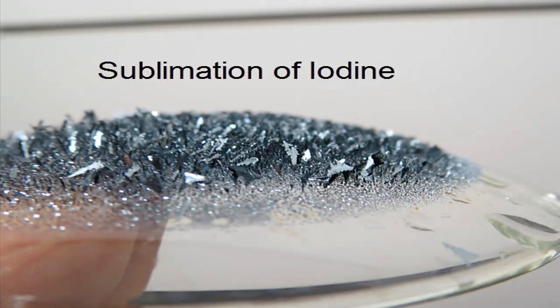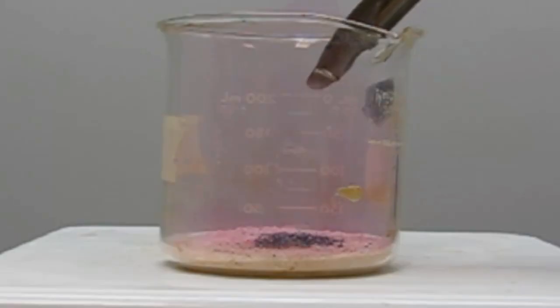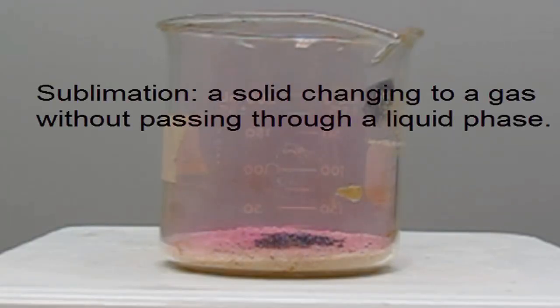In this video, we're going to look at the sublimation of iodine. So when we add solid iodine to hot sand, we have a hot plate underneath there, you can see right away we start getting a purple gas. That is iodine gas, and with sublimation we're going directly from a solid to a gas without passing through a liquid phase.